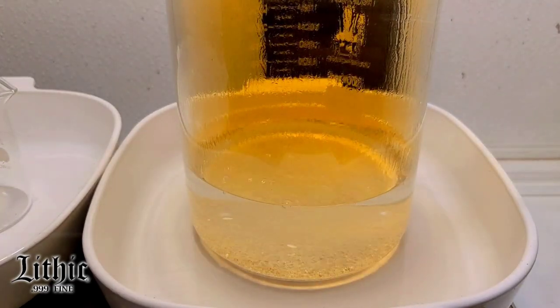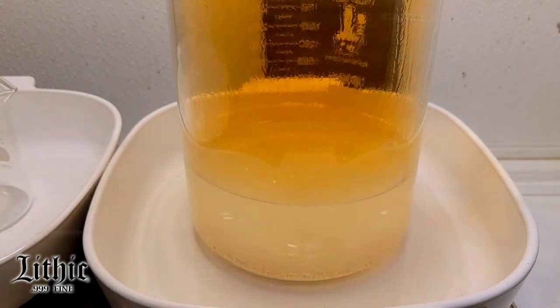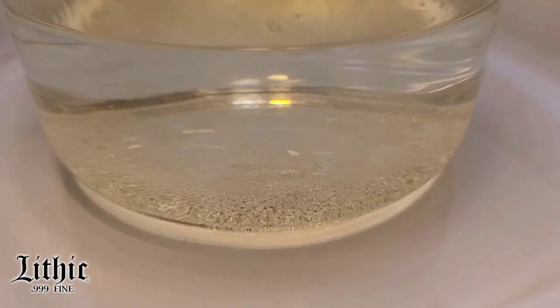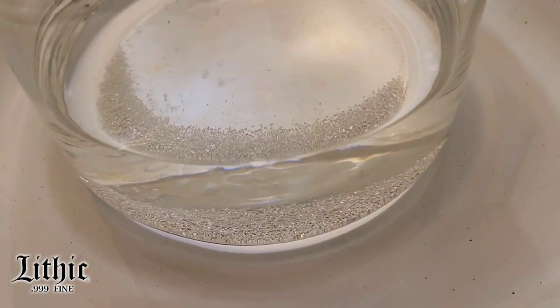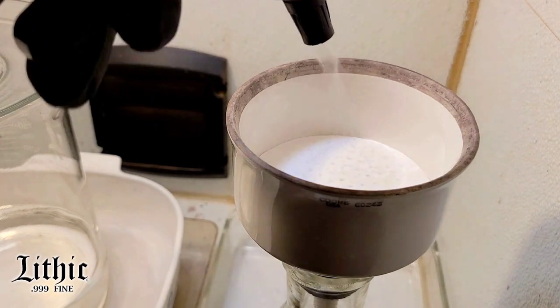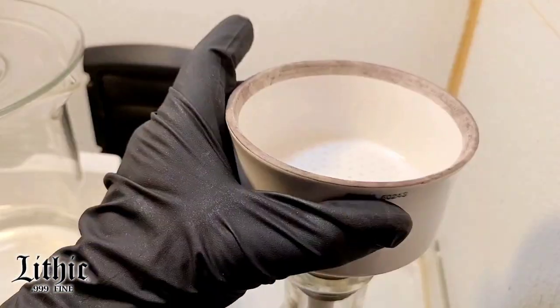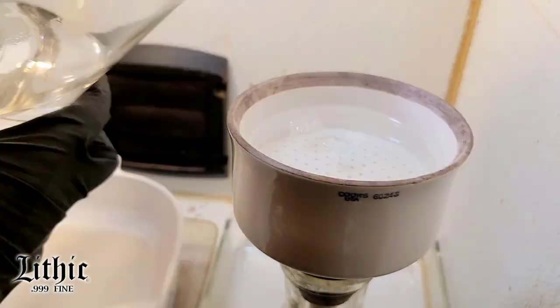I calculated — I do approximately 310 grams of silver crystal to 200 ml of nitric acid and I'm left with about 10 grams of silver. I want just a little bit of silver left because then I know that the reaction's over and there's no free nitrates still in solution.